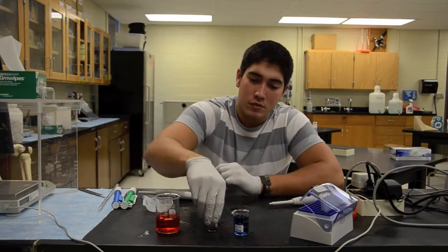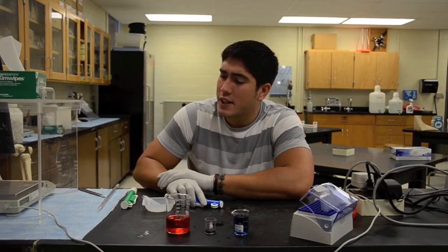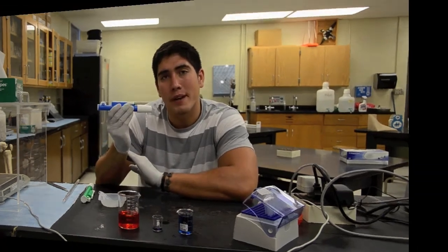Eject our tip. And now we have a nice purple solution. Okay, now that I've showed you how to use the micropipettes, Stephen's going to come in and show you how to use the manual pipettes.